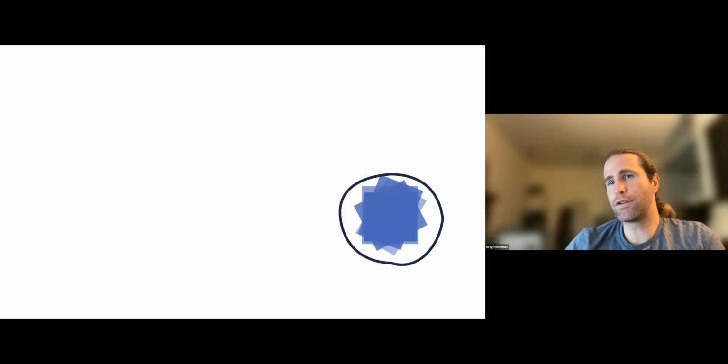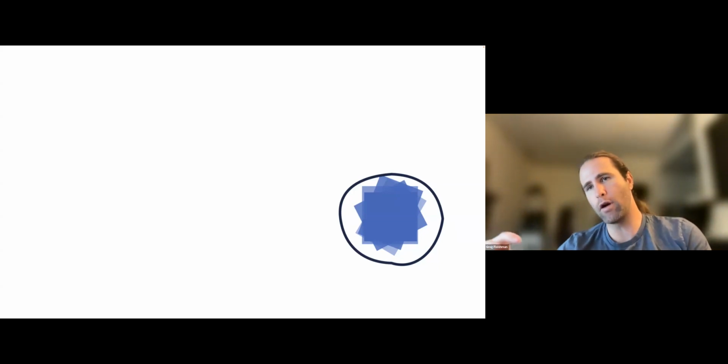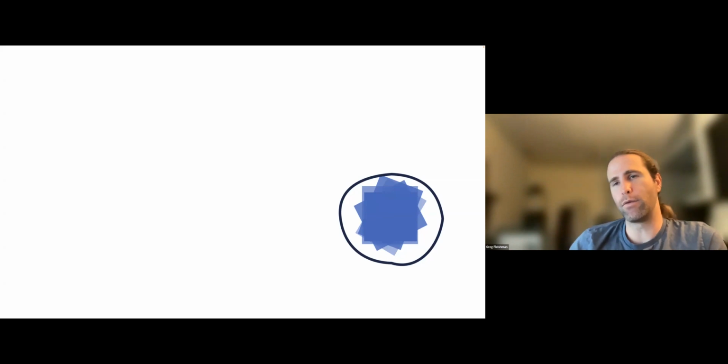You could consider yourself done at this point and say all of my data is registered to the same coordinate system. But there are a few limitations with that. The first is that all of the individual subject images now look like the brain of that one individual. They've all been deformed or warped to match the brain of that one individual subject.